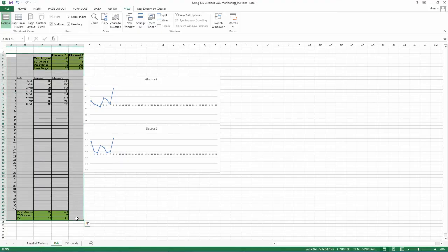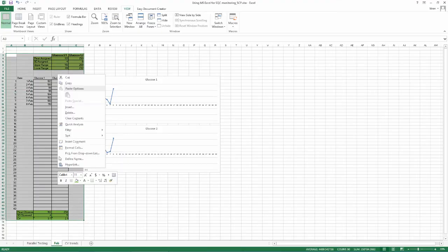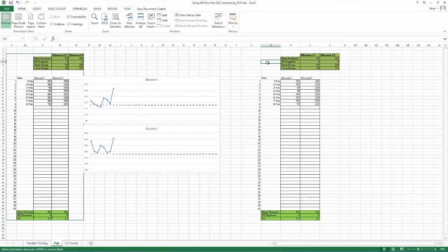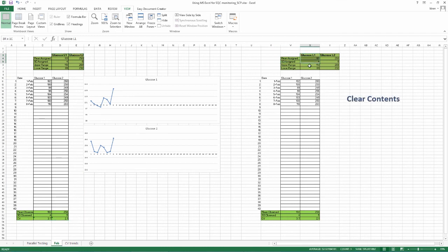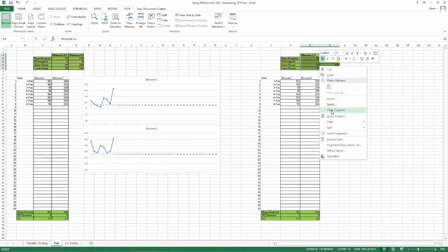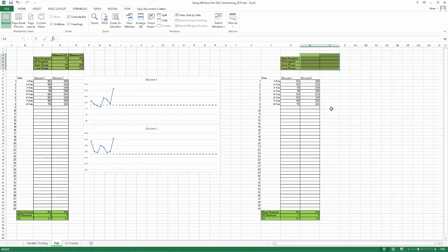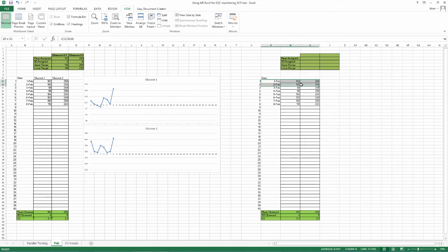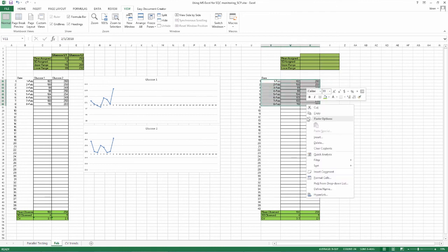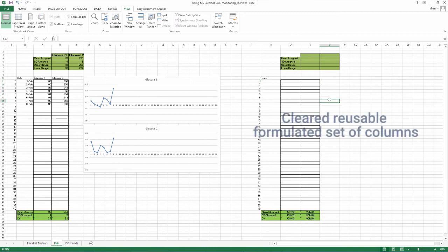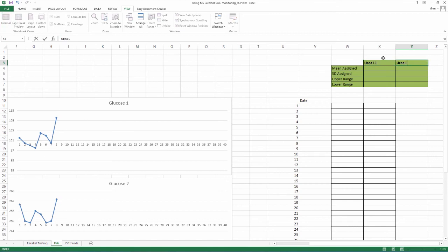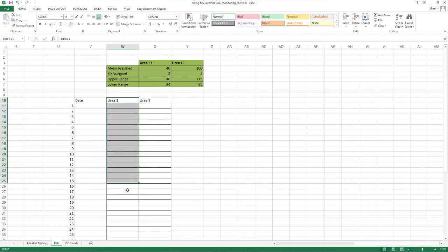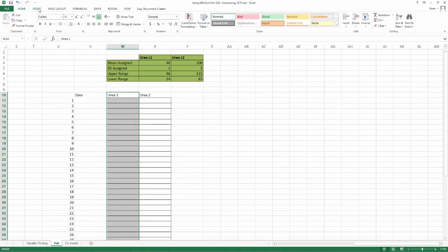Once one parameter has been configured, we can copy paste it to be used in other parameters. For other parameters in the same month, copy and paste as showed. Now, clear contents both from the heading as well as value inputs and repurpose for the next parameter, say urea. Clearing contents in heading with regard to glucose. Clearing contents in the value input sheet. A cleared reusable formulated set of columns. Inserting assigned data referring to urea 1 and 2.